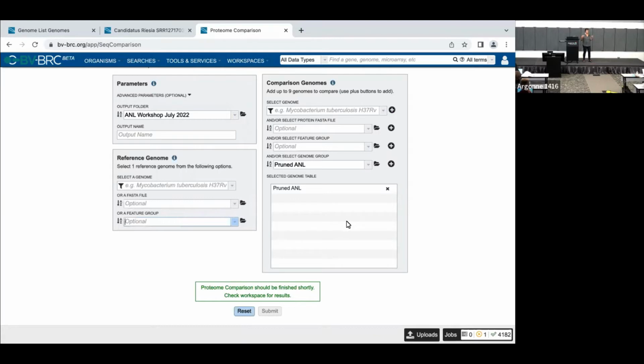Usually every job, every single service in the system, the phylogenetic tree is looking at protein families. It has to be annotated. It has to be translated into BV-BRC for the service to see it. So I had to tell them, you have to annotate them first, and then you can build the tree with them. You can't just have contigs out there. It's not going to work.